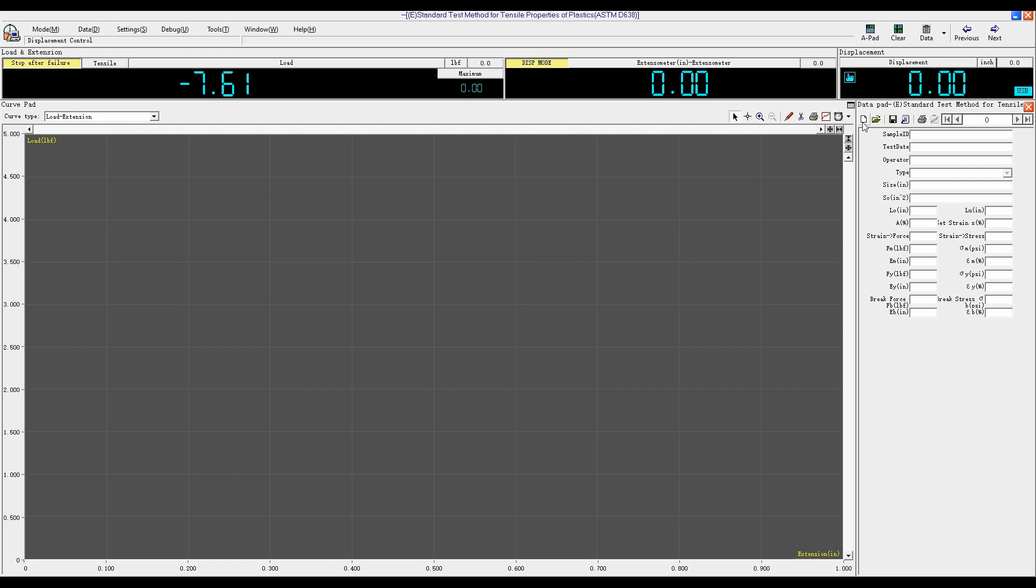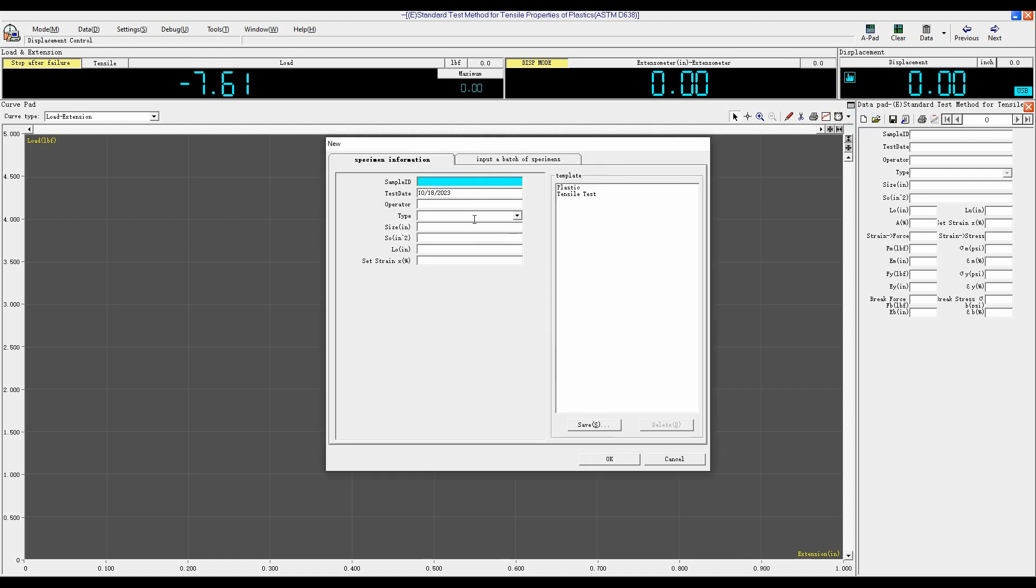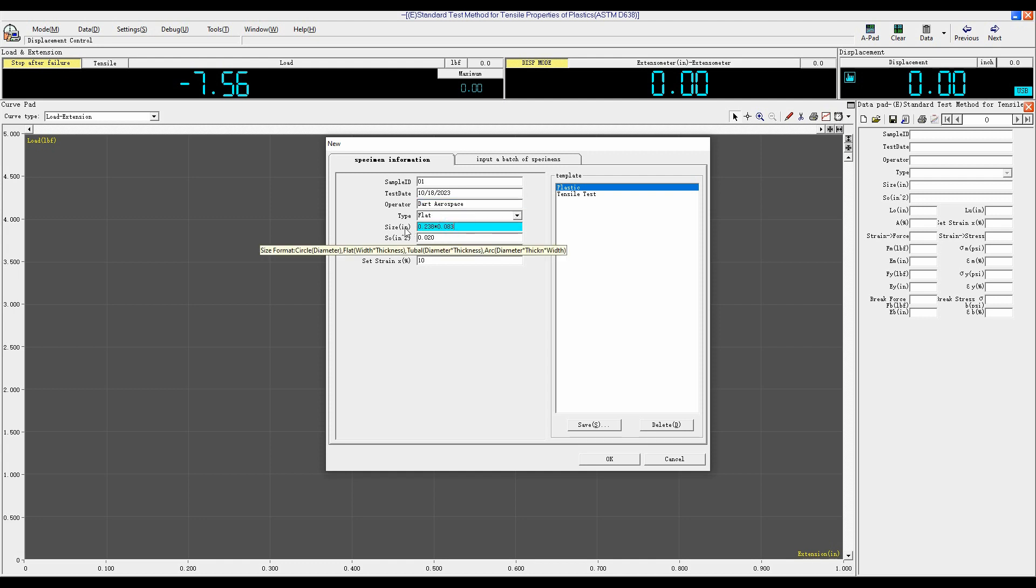Click New to input the sample information. For example, the operator, the sample is flat. And input its width and thickness. The section area will automatically calculate it.